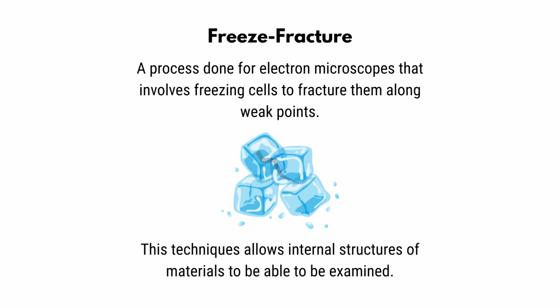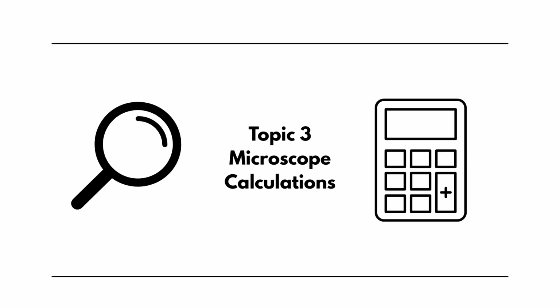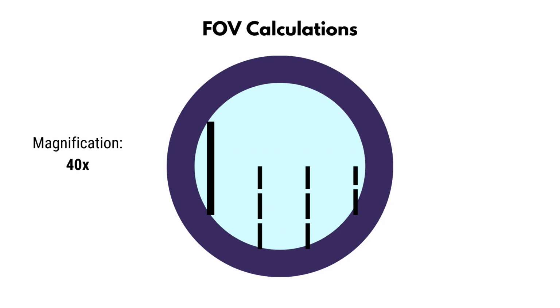Now let's start off with some microscope calculations. This is most likely going to be on the IB exam in one way or another, and will definitely be on your unit tests if you are being taught this unit at school. Let's start off with some FOV calculations.